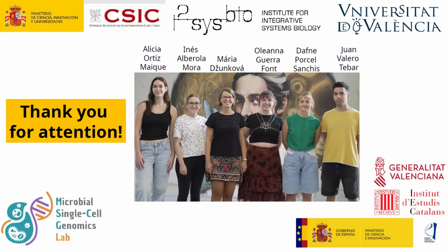And obviously, these primers are much more expensive. One costs about 250 euros, more or less. But maybe you can find some cheaper options. And yeah, so this is how we proceed.